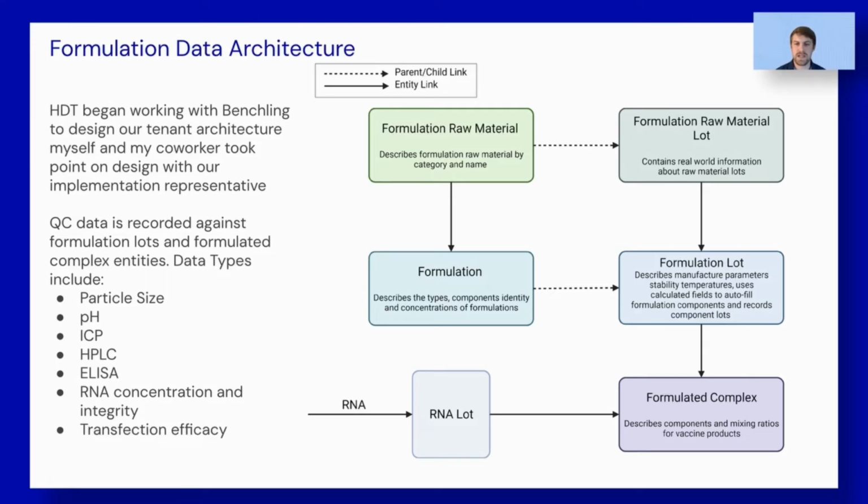This allows a user to easily input the formulation raw material lots that are being used in lab to create the formulation itself. Again, the formulation lot also has metadata associated with it, data like manufacturing lot size and manufacture date.